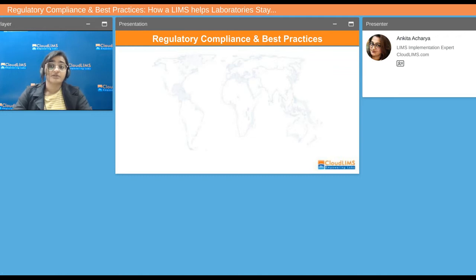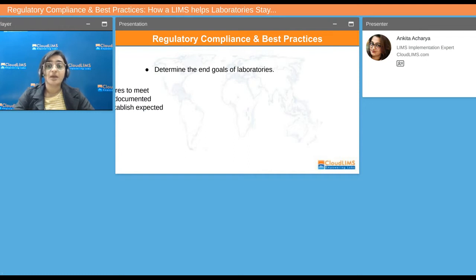Now that we have discussed the challenges and why it is important, let's talk a little bit about some of the best practices that you can implement to ensure that you can easily meet these compliance requirements. Starting with, always have a clear determination of the end goals of the laboratory. You should be clear about what the end goal of your laboratory is. Whether you are a testing lab, a research lab, or a manufacturing unit, you should be extremely clear about your lab's end goals.